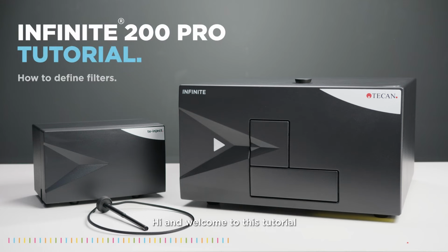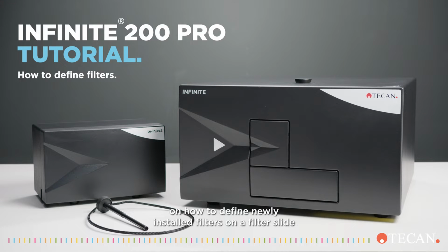Hi, and welcome to this tutorial on how to define newly installed filters on a filter slide in iControl.